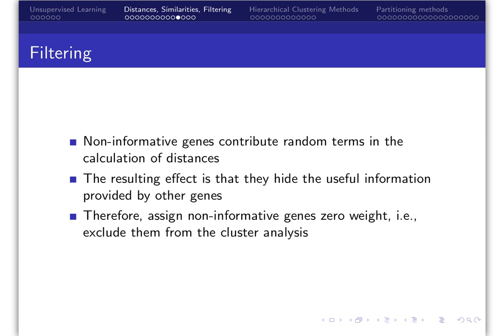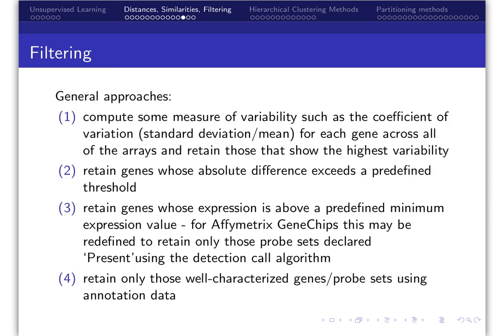The filtering step may exclude spots or probe sets with too many bad values on the arrays, exclude spots or probe sets that do not vary significantly, or may exclude spots or probe sets with a fold change less than an arbitrary threshold. This is an important step prior to high-level data analysis because most algorithms used in such analyses do not perform well with thousands of variables.